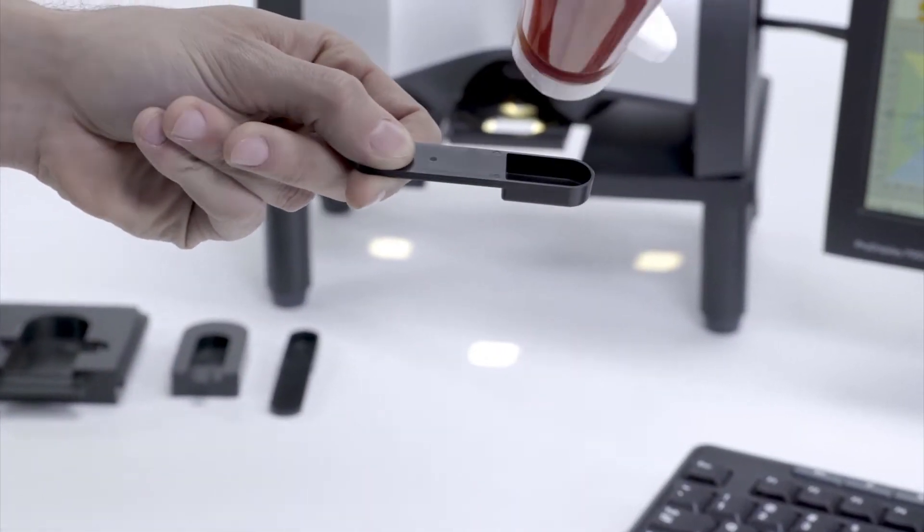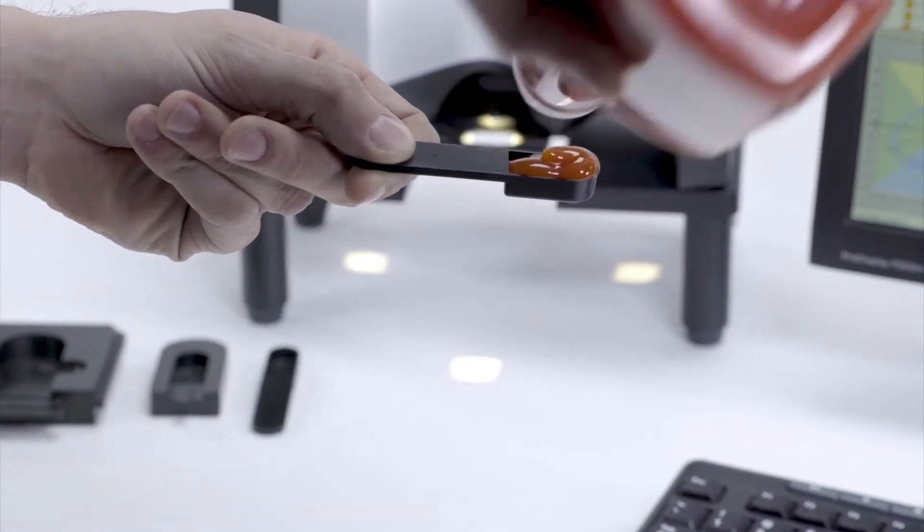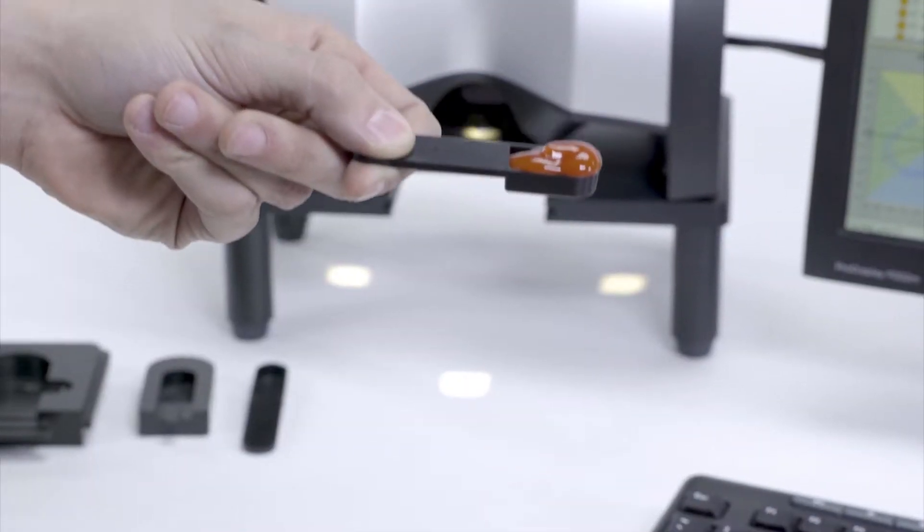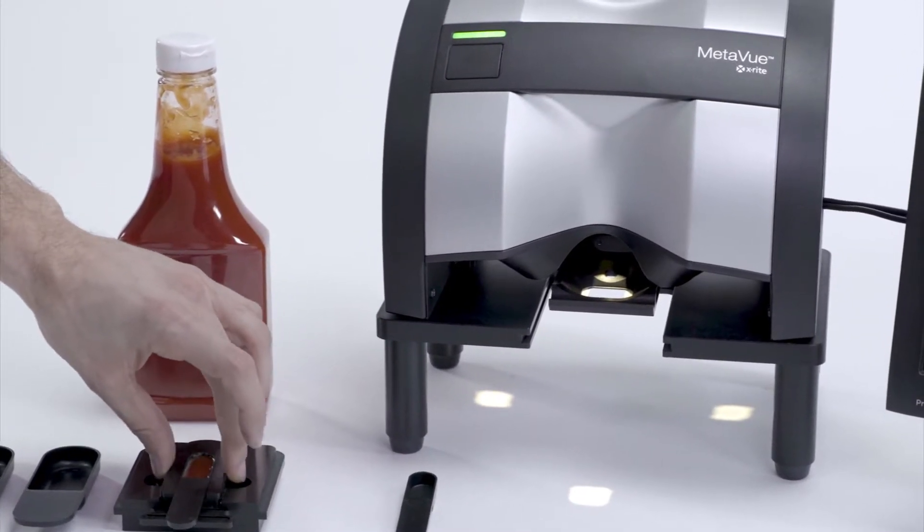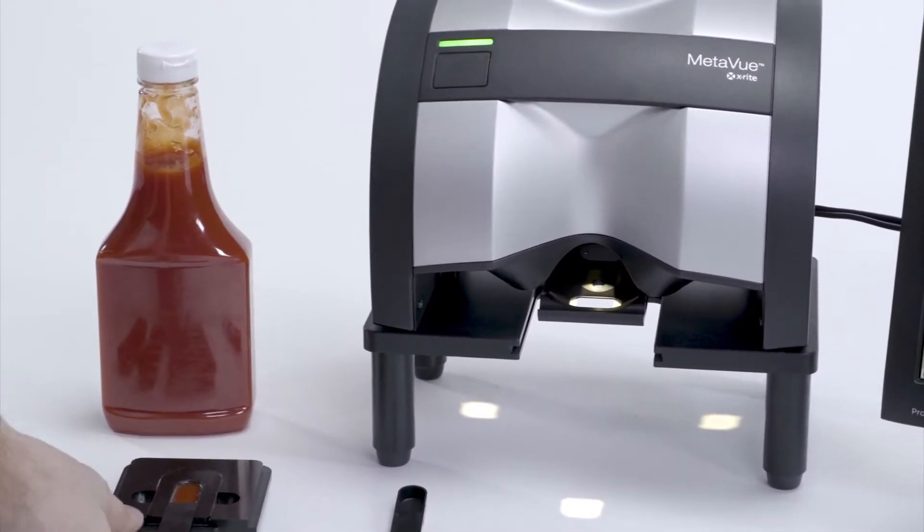Similarly, liquids, pastes, and gels can be put into a spoon, leveled if necessary, and the spoon placed into the sample holder. The material is now correctly presented for measurement.